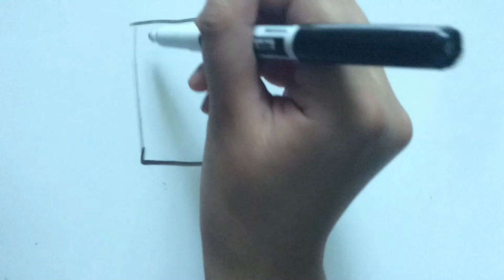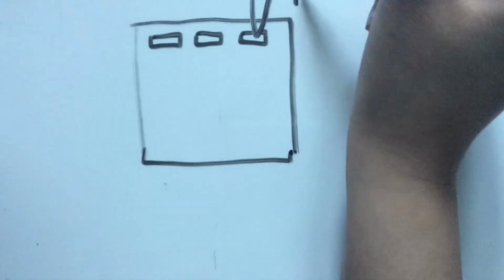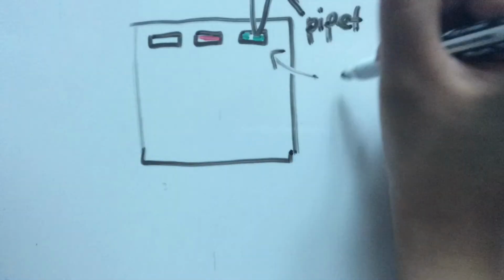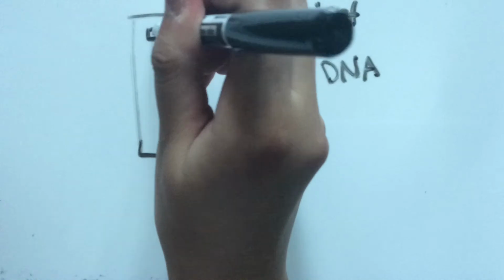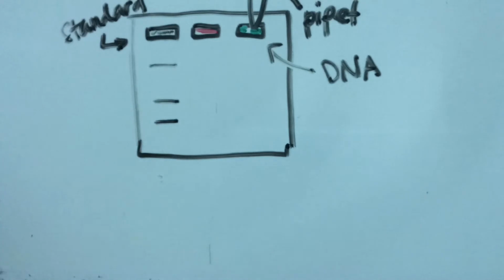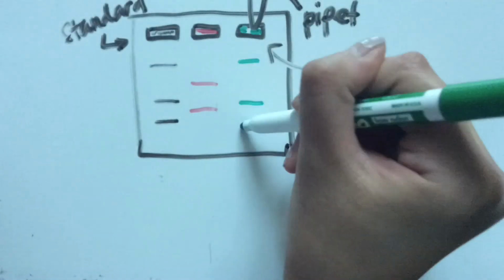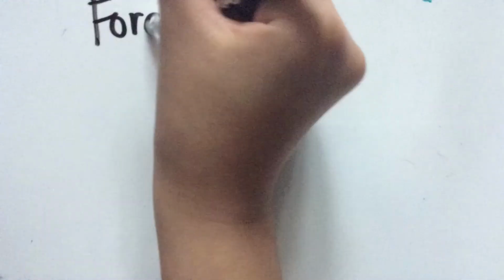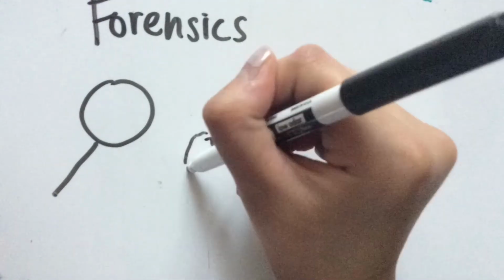To perform gel electrophoresis, DNA samples with a colored dye are pipetted into wells on the negative end of the gel. Current is then applied and the strands migrate, creating bands located at different parts of the gel. A molecular standard or DNA ladder can also be placed into one of the wells to compare size of the strands. Researchers use gel electrophoresis in order to isolate the DNA they need to use in their experiment. Once the DNA is purified in this way, the researchers can sequence DNA or apply their use in various other biotechnological processes.